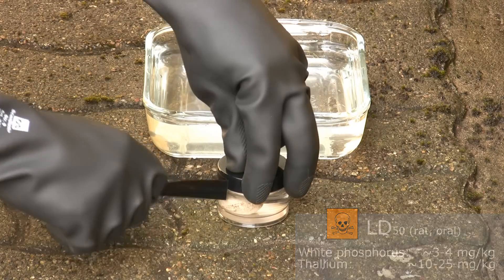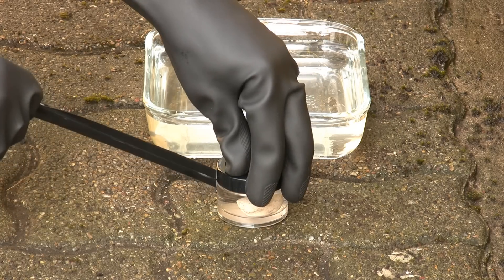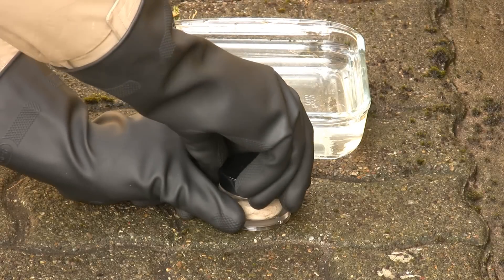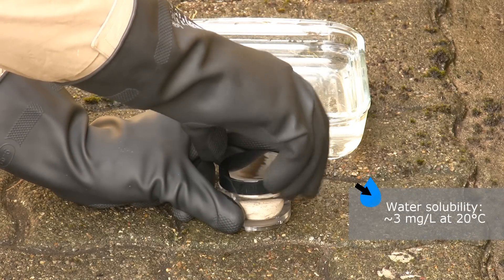The sample is stored in water to keep the oxygen in the air away from it. Otherwise we would have a fire. White phosphorus is practically insoluble in water. But I still wouldn't drink this water.